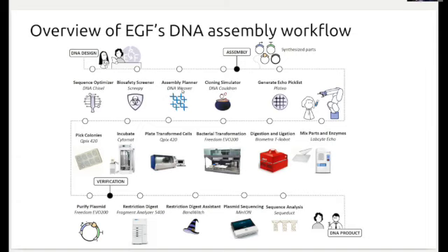At this stage, the work is handed over to the research technologists from the wet lab team, who use these files to start the procedure, which is mixing the parts and the enzymes with the Labcyte acoustic transfer machine, incubating them, and then transforming the plasmid construct into bacteria using the Tecan Freedom Evo automated liquid handler, and then incubating the cells and picking the colonies with the QPix colony picker.